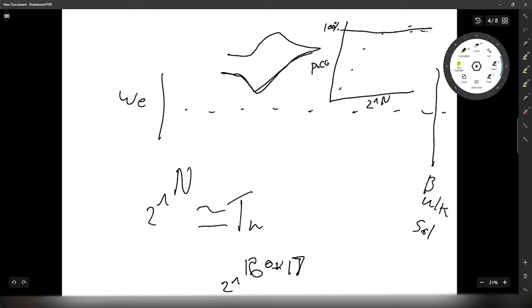For FTAC-CV, you'll end up probably looking at the highest harmonic you'll get in the information, and if it's remaining constant, that probably means that it's a good sample size. If you use weird values of dt, you're just going to get really weird parameter values for you to calculate.